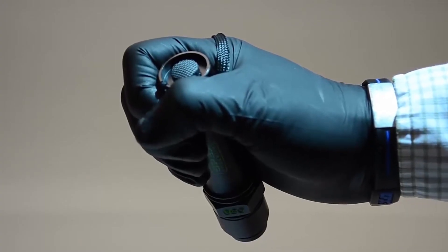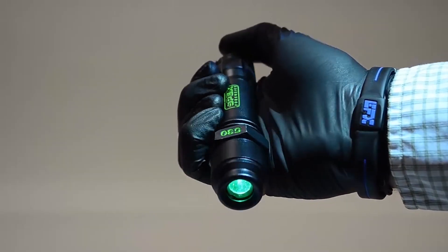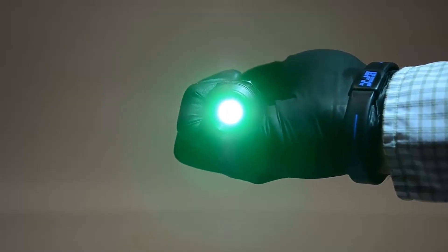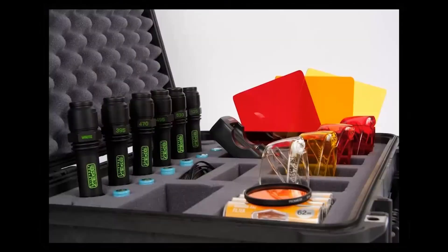With a push button start and zero warm up time, the Focus provides a minimum of two hours of run time on a fully charged battery. The Focus comes standard as a kit of six wavelengths, including the appropriate goggles and camera filters, all accessories packed into one case for easy transportation.